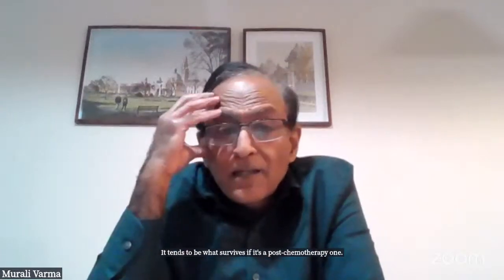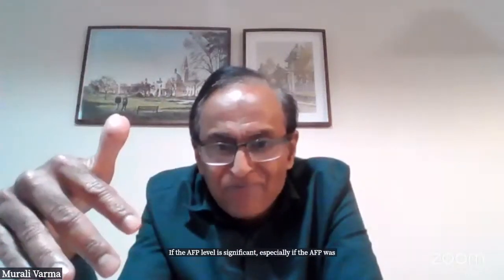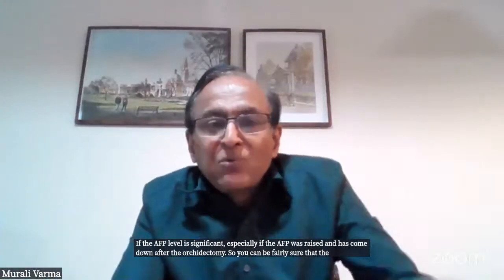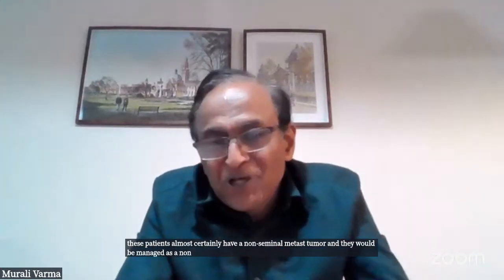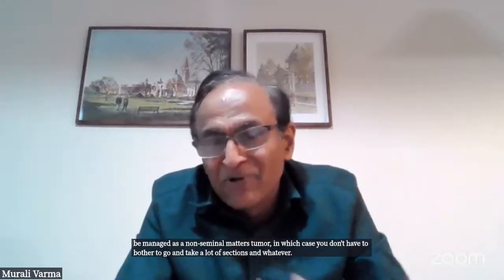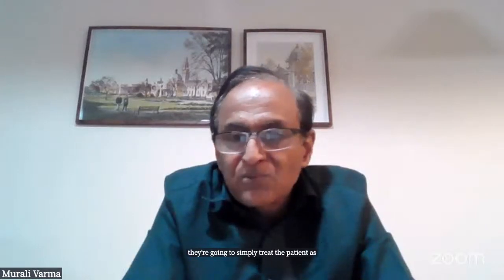Yeah, the other one with regressed, I think it's always useful to check the AFP level, especially if the AFP was raised and has come down after the orchidectomy, so you can be fairly sure that the source of the AFP was the testis. These patients almost certainly have a non-seminomatous tumor, and they would be managed as a non-seminomatous tumor, in which case you don't have to bother to take a lot of sections, because whatever you call it, even if you were to report it as regressed, they're going to simply treat the patient as a non-seminomatous tumor.